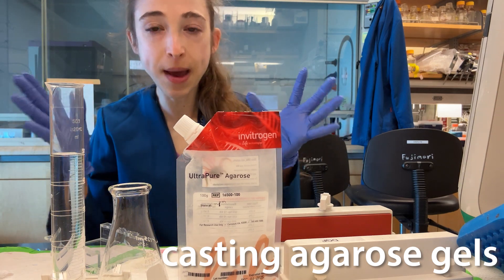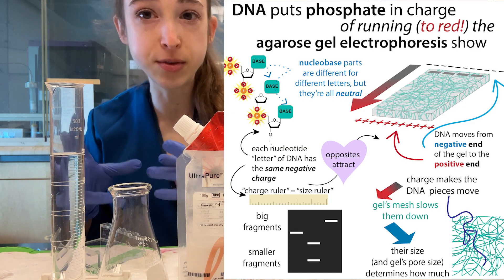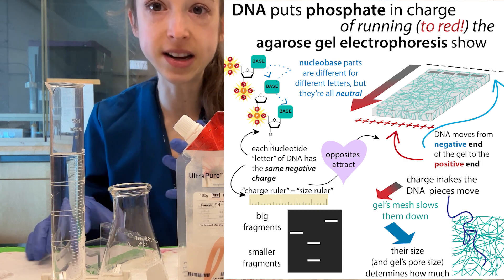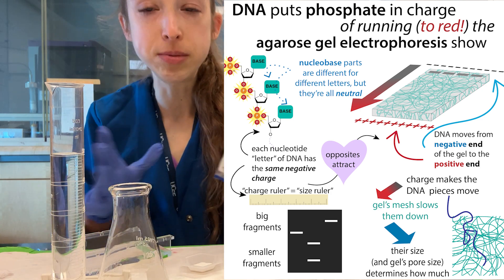And for today's trick, I shall cast a spell. Well, actually no, but I will cast an agarose gel. So agarose gel electrophoresis is a method we use in order to separate DNA pieces by size by sending them through a gel made up of a mesh of the sugar agarose. And so I'll show you how we make these gels.